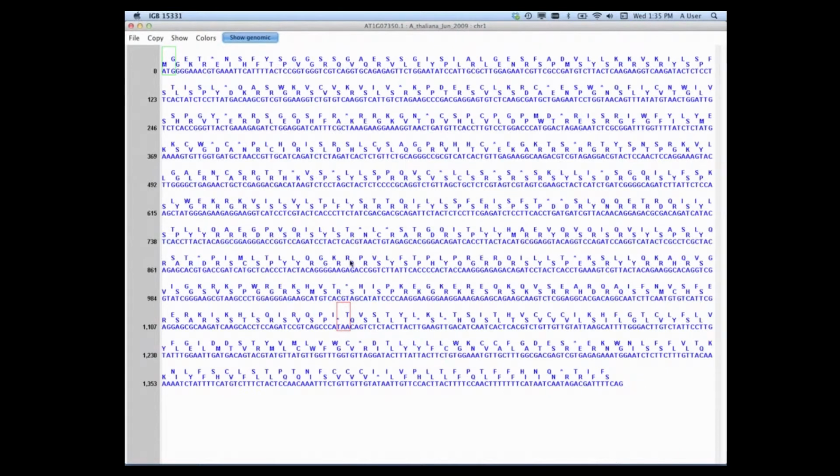Seeing these is obviously very nice, but being able to use them is even better. So we have a lot of copy functions. For instance, if you copy DNA with lowercase introns and start and stop codons, what that will do is copy the entire genomic DNA sequence, and anywhere that there's an intron or the start and stop, those will be copied out in lowercase so that you can get some of that annotation information.